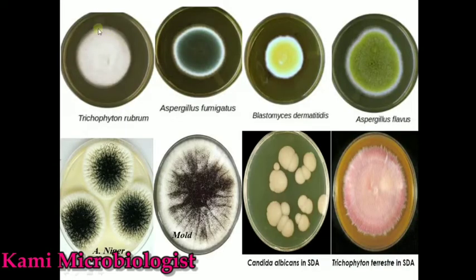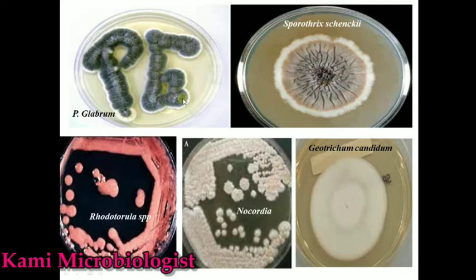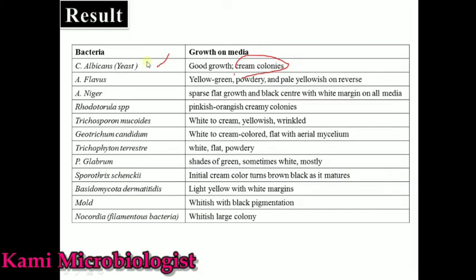Penicillium shows shades of green, sometimes whitish colonies. As you can see on screen, these are the Penicillium colonies. Sporothrix schenckii mostly produces initially creamy-colored colonies that turn brown to black when mature — as shown, these are the Sporothrix schenckii colonies.